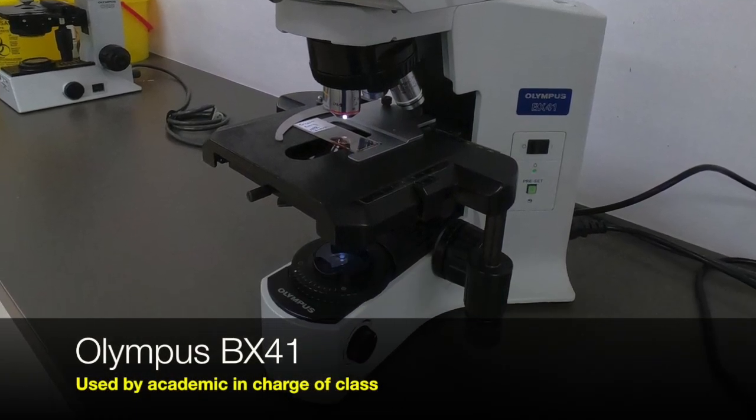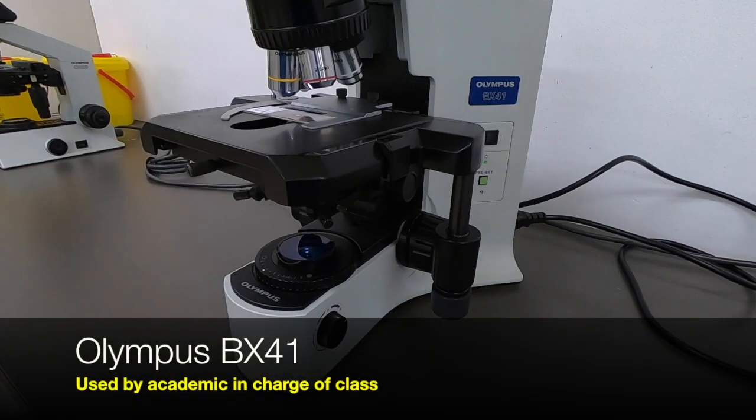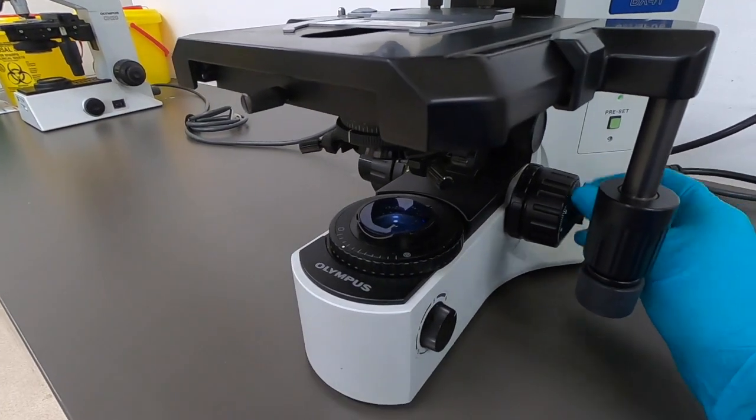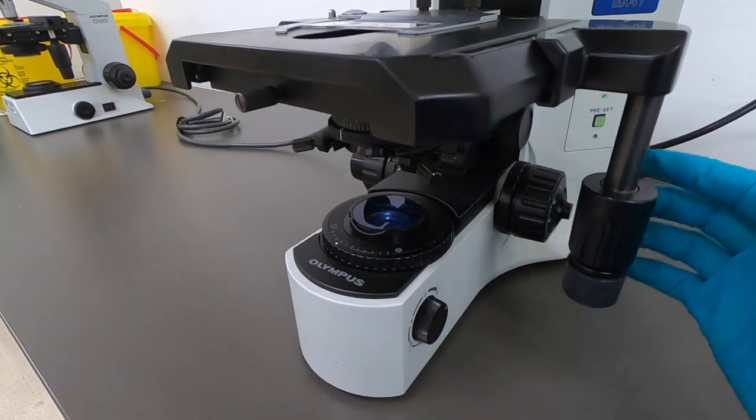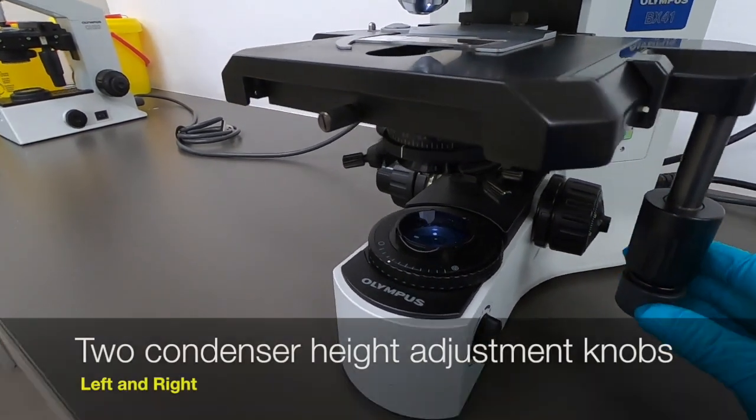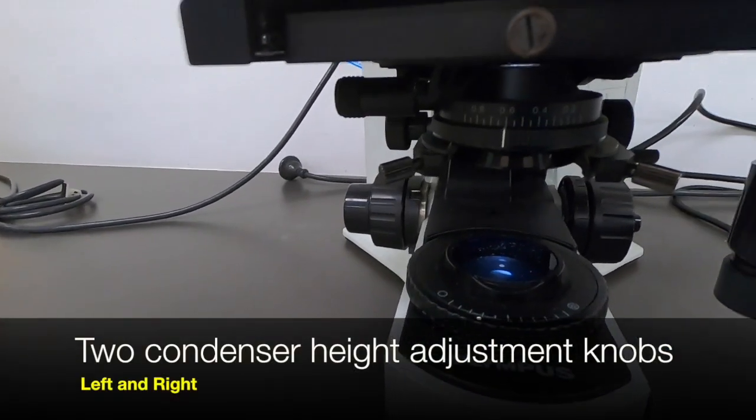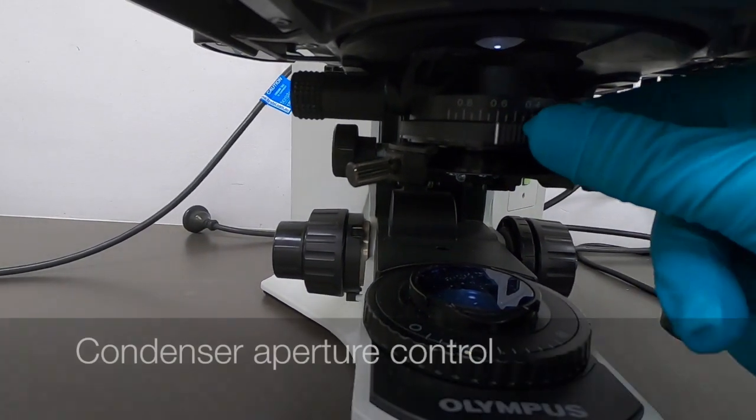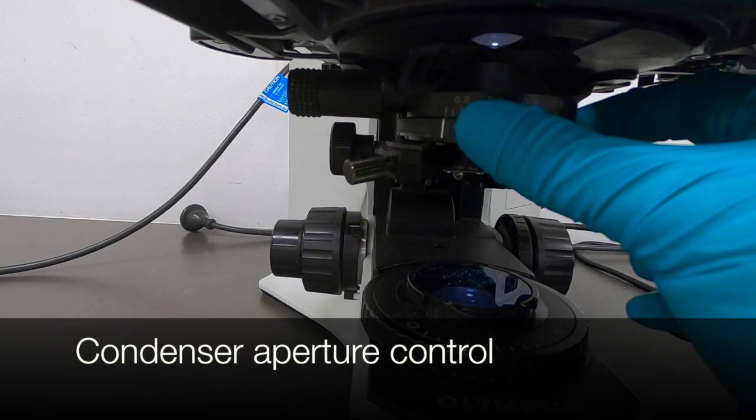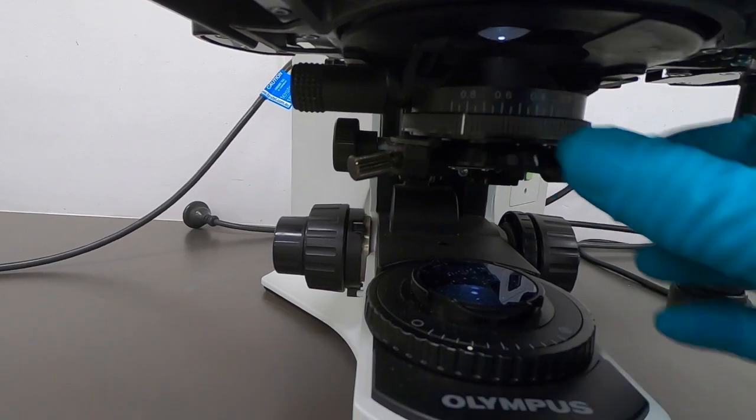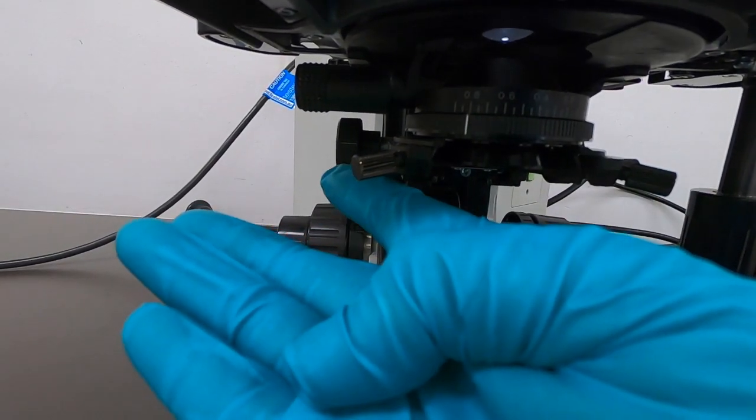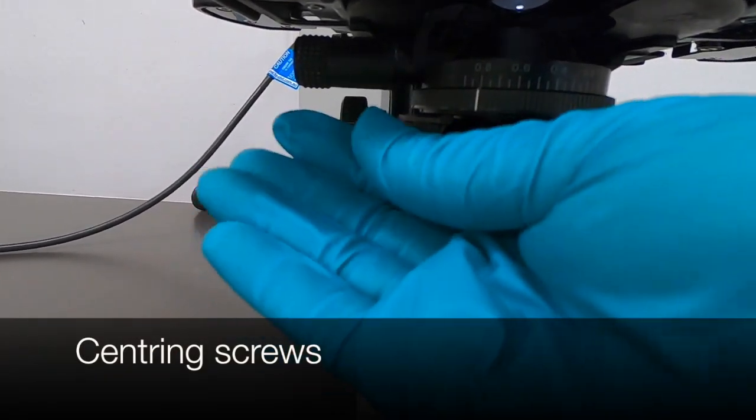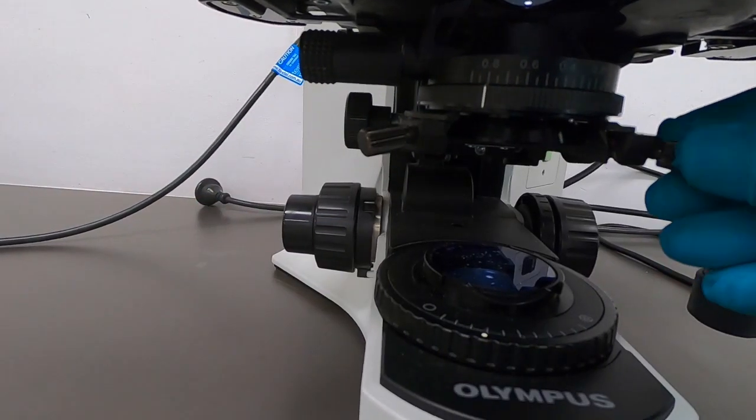Now, switching to the Olympus BX41, this is not available to students, but would be available to one of the teaching staff. There's actually two height adjustment knobs left and right for the condenser. We've got the aperture control here, again, with some numbers which you could record to save time corresponding to each lens. We've got these centering screws for centering the condenser, and we've got control over the field aperture.